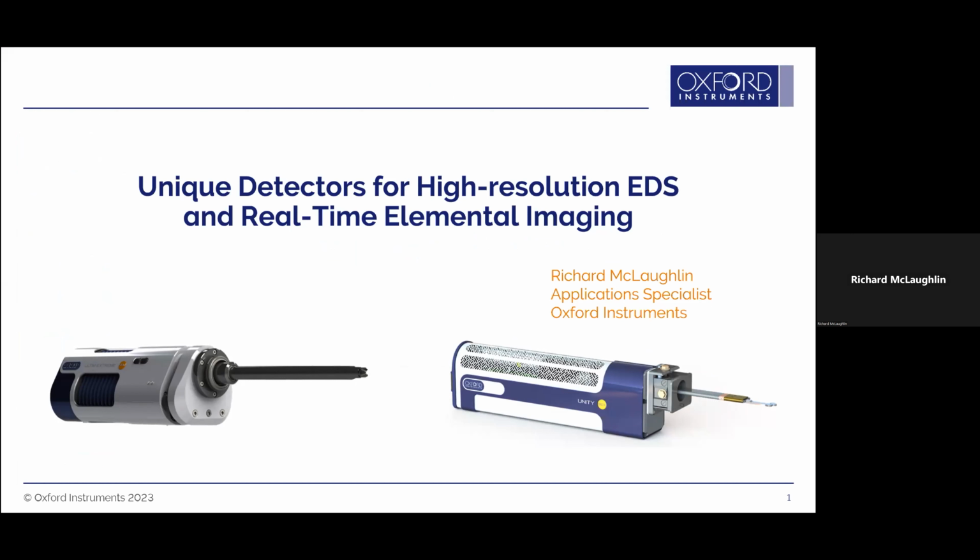So I'm going to be talking about unique detectors for high resolution EDS and real-time elemental imaging. I think people who are familiar with EDS detectors or have an EDS system would recognize a standard EDS detector. It would be a detector with a round sensor, a collimator, and an electron trap.